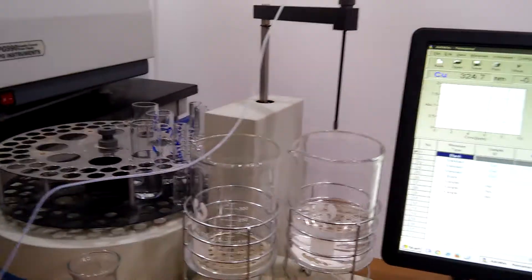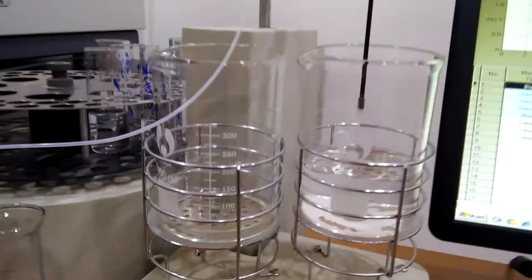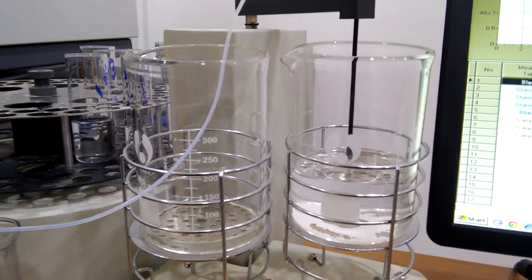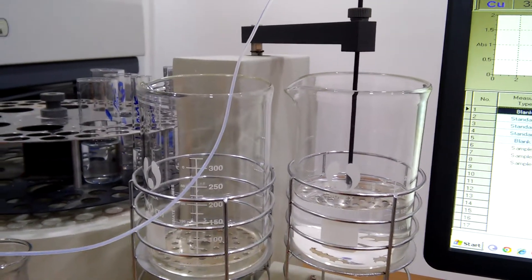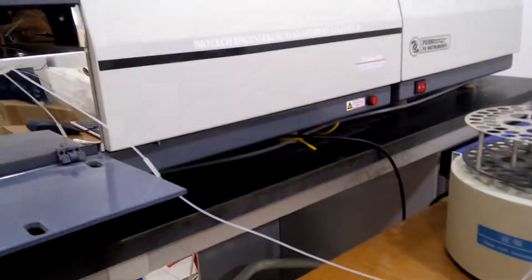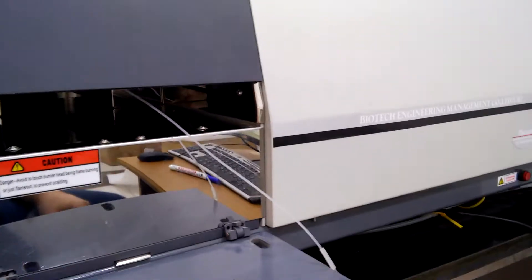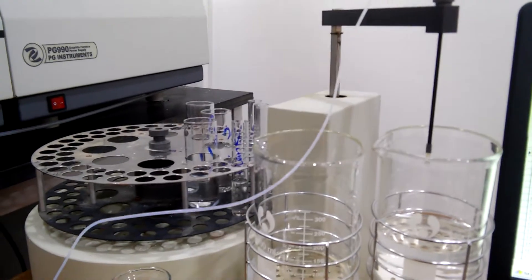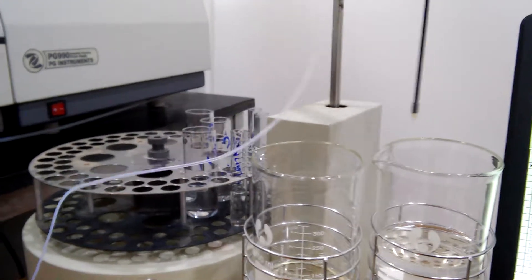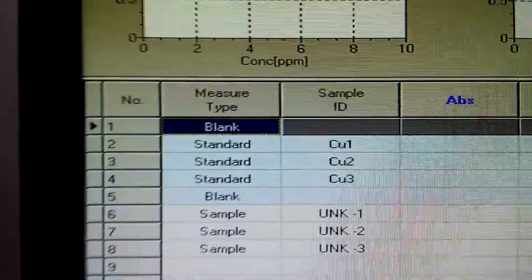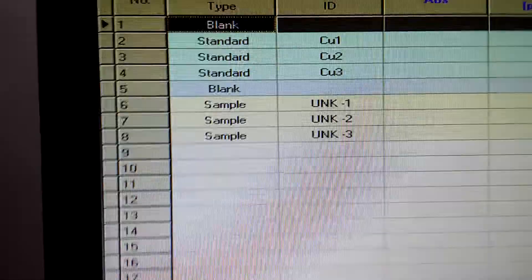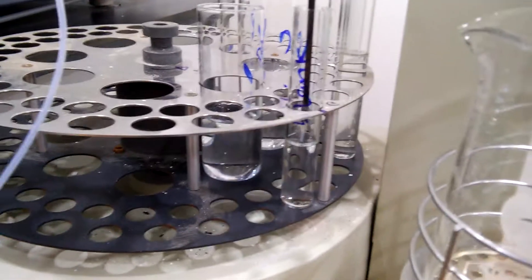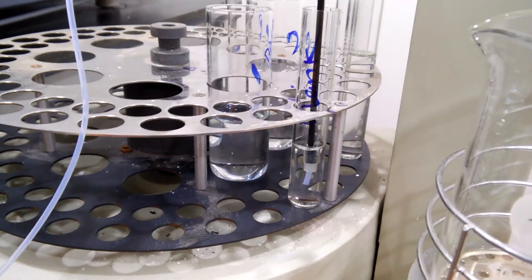This is the auto sampler. This is deionized water. It's going to wash the tubing first which is going to the atomizer. See here, it will suck the blank. So this is the blank tube filled with the deionized water as well.